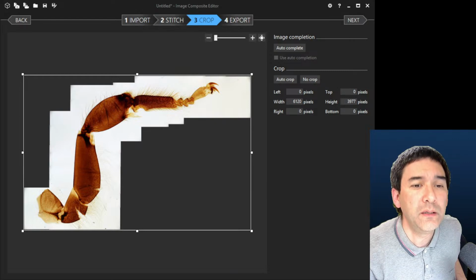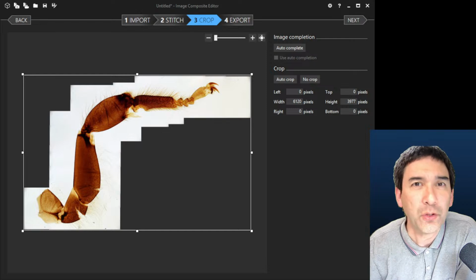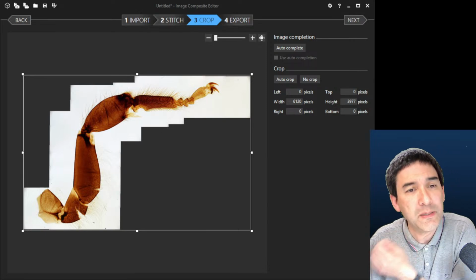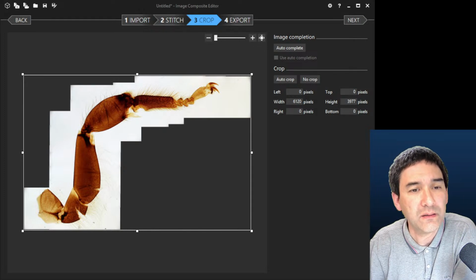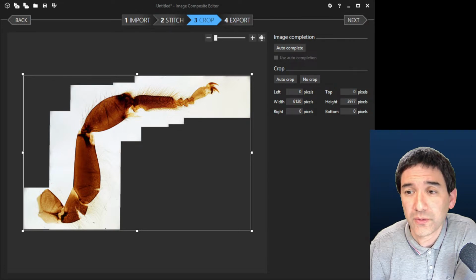Oh, I see what you mean. Because it says here it works for Windows Vista, Windows 7, Windows 8. Yes, I've got Windows 11 and it works. Okay, sorry, now I understand. The specifications say Windows 7, Windows 8, and so on, but it should actually work because I'm using it right now. Okay, so now I get what the question is.